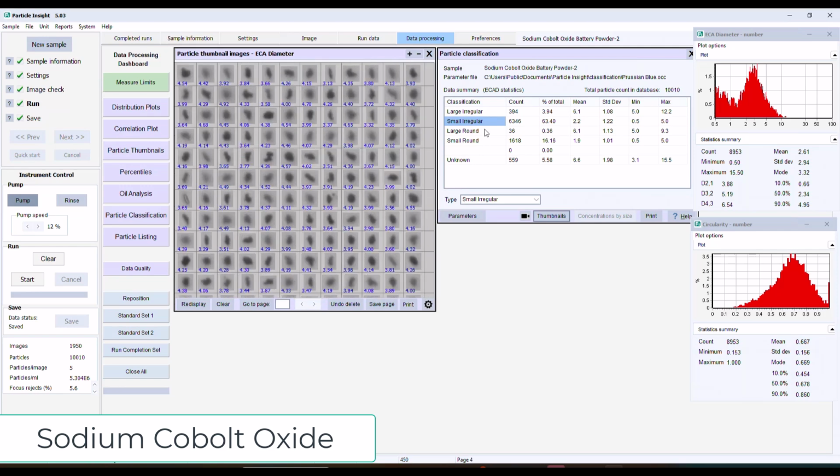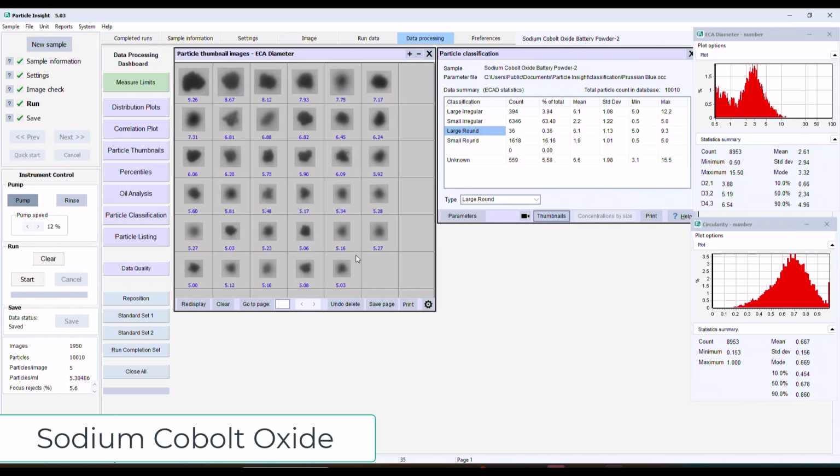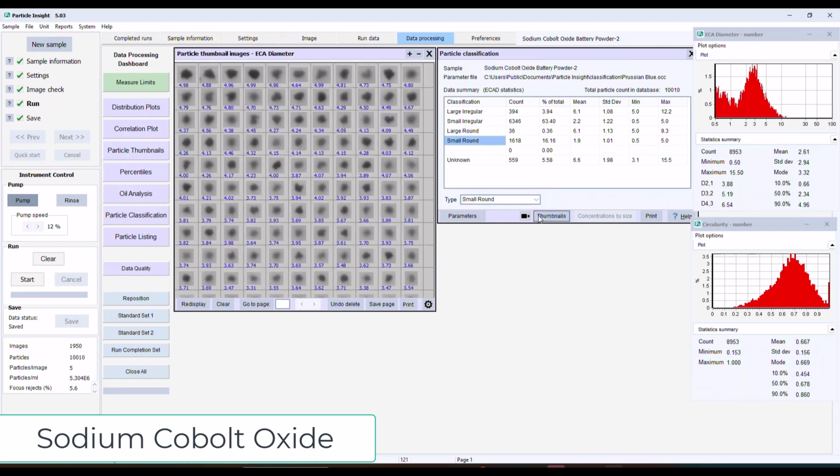We should be able to see that in a comparison of all samples, and we look at that by aspect ratio. We'll be doing that at the end of all four samples.